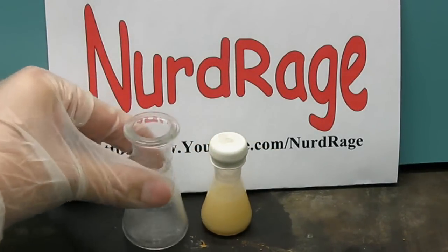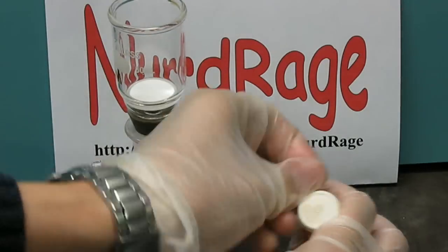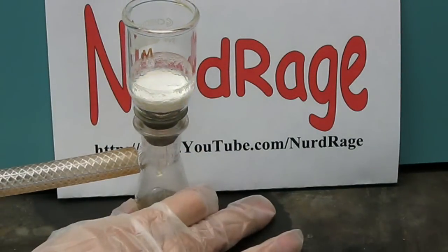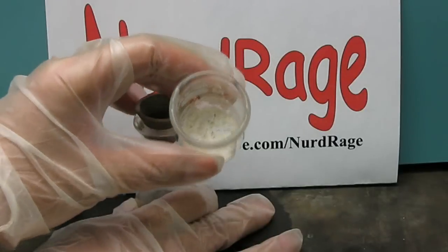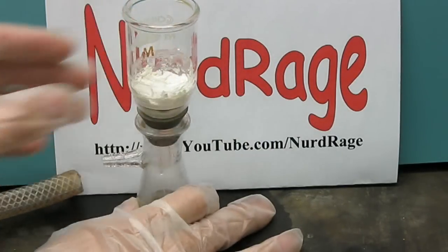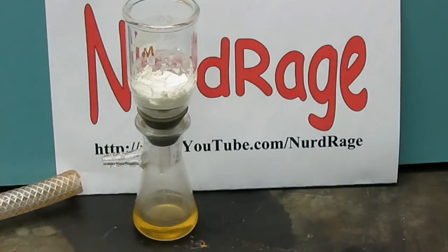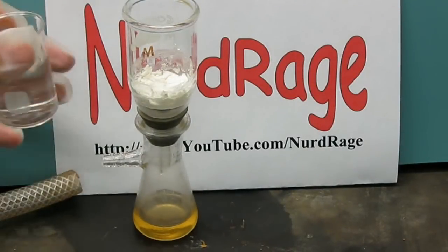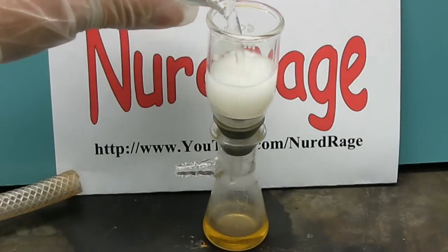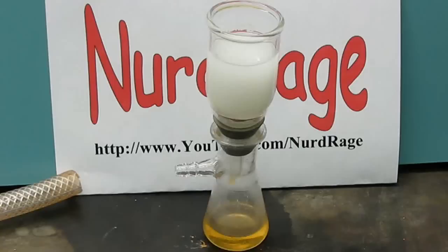Use a vacuum flask and a glass-fitted Büchner funnel and filter by the vacuum filtration technique. Here is our crude TCPO product and a byproduct of triethylamine hydrochloride. To separate the two, we simply add 25mL of methanol, which will dissolve all the triethylamine hydrochloride but very little of the valuable TCPO.